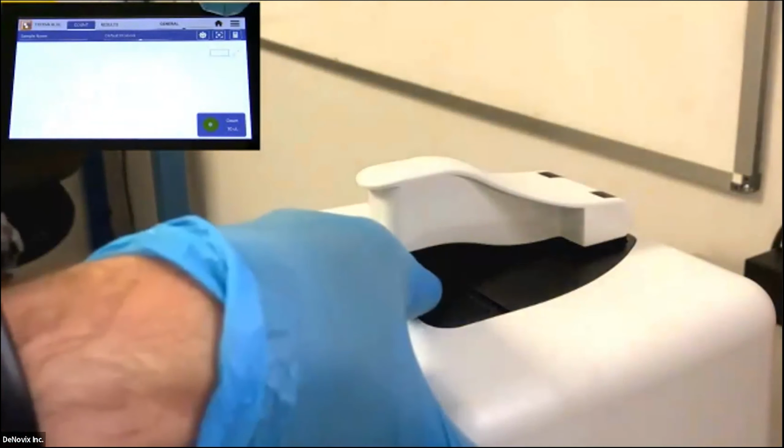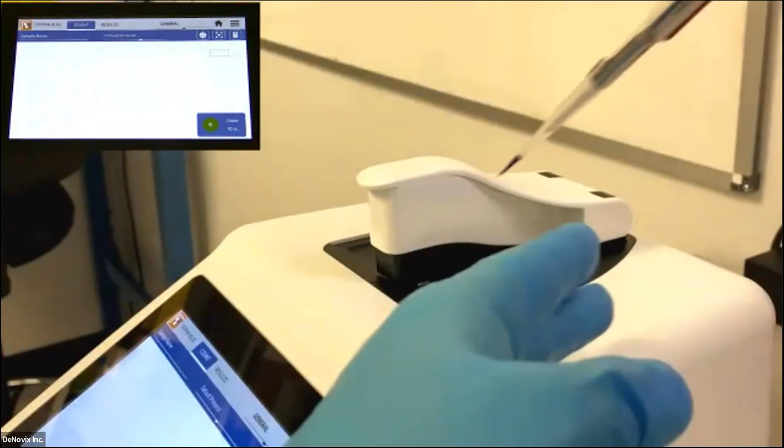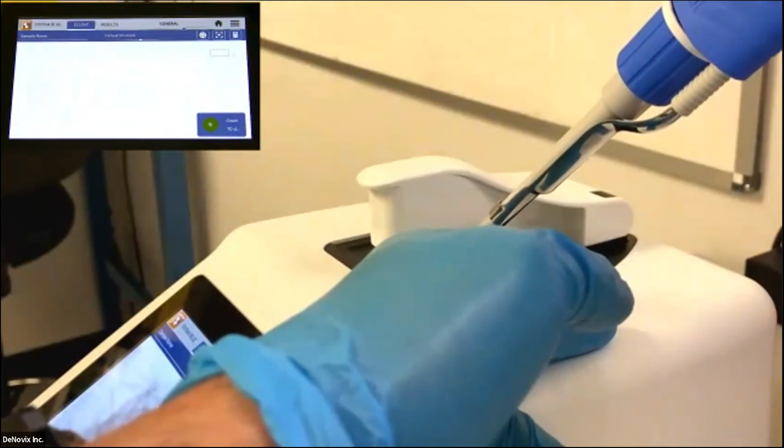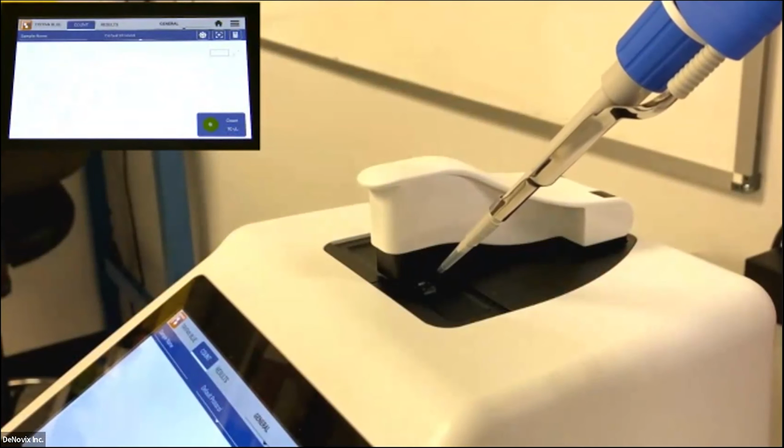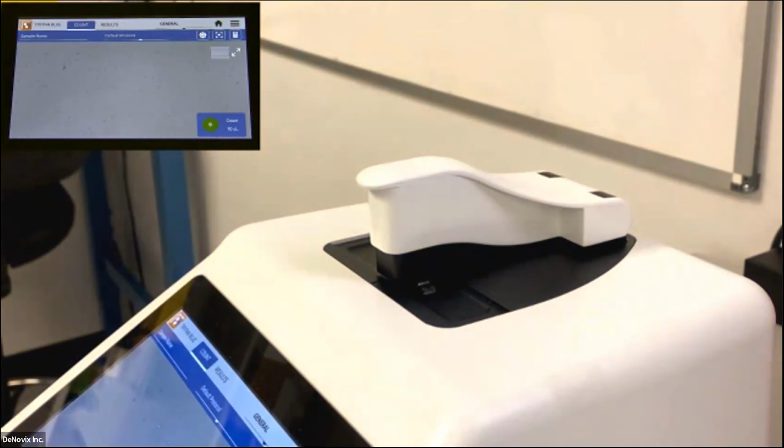Now, quick overview of how to load the CellDrop. There is a groove here on the sapphire surface. So I'm going to put my pipette directly into that groove, bring it all the way against the top surface, and eject the cells in.